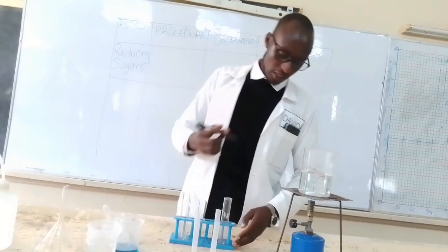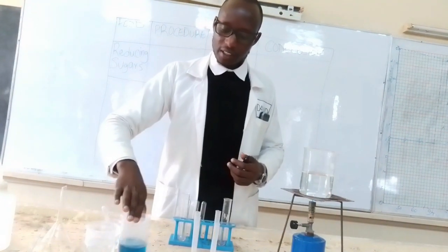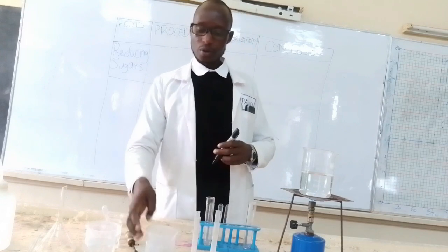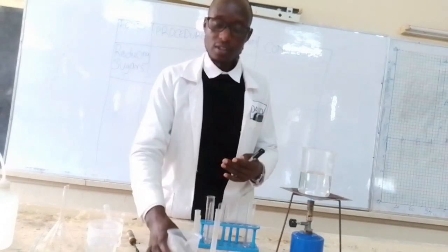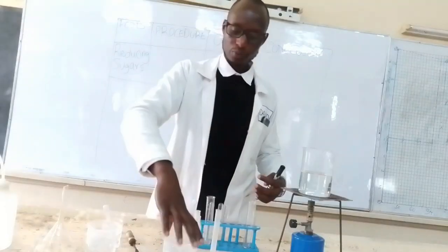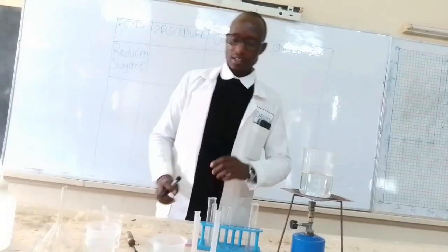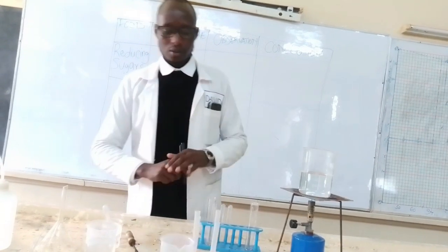Hello guys, in our previous video we did the preparation of Benedict solution, and now in this video we are going to actually use the same Benedict solution that we prepared in our last video to see how it is used to test for the simple sugars that we mentioned during that video. And from there we are going to start over.